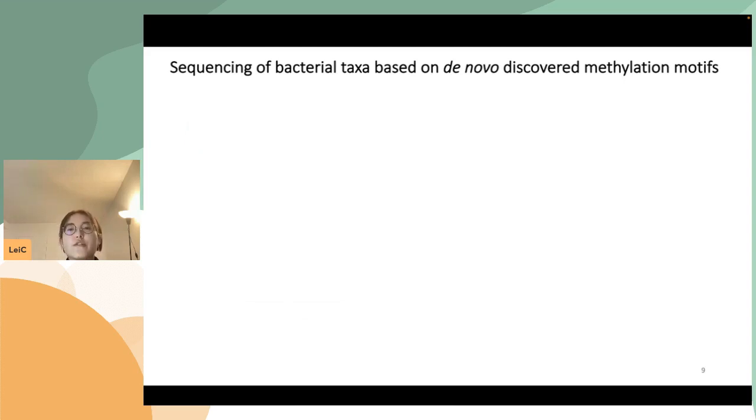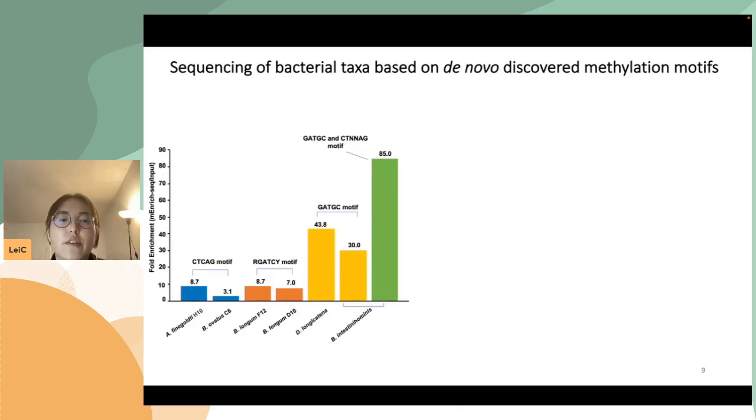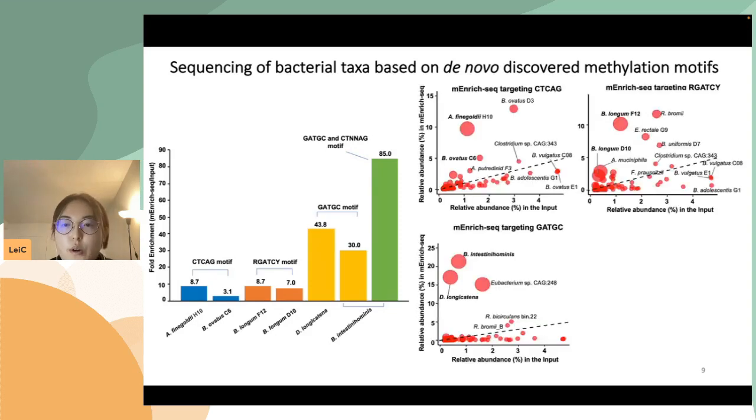For demonstration purposes, we here demonstrate the use of either individual restriction enzymes or multiple REs in combination to enrich bacteria from an adult fecal sample. When using a single RE, we can already significantly enrich 6 bacteria species, here as high as 43-fold.